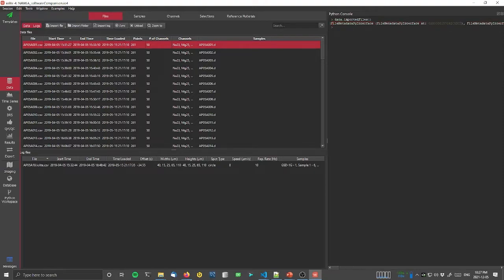You can see that it's a list because it has this comma here. So it has what it is, and then it actually tells us where it is in memory. We don't need to worry about that last part there. Now if I wanted to get one of these files, I'd just take the first one in the list. So I'd say f equals data.imported files. That's the list, and then I'll just take the first object from that list. So now f is just a single file metadata interface, and now we can actually have a look at it.